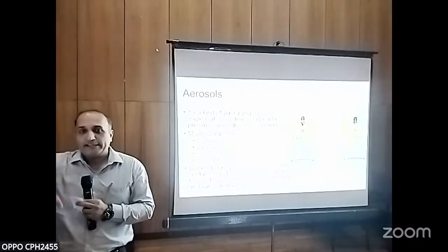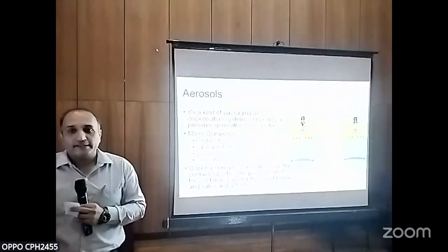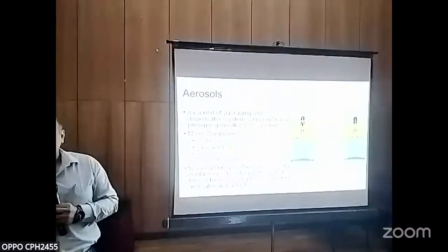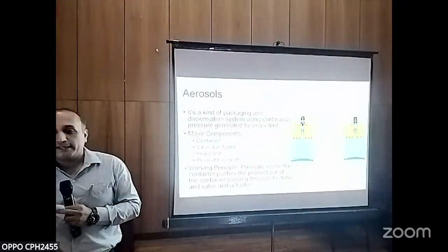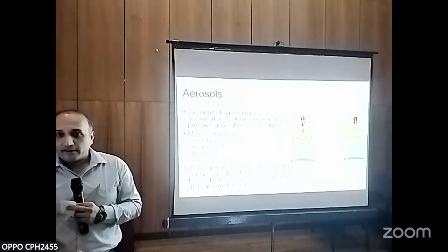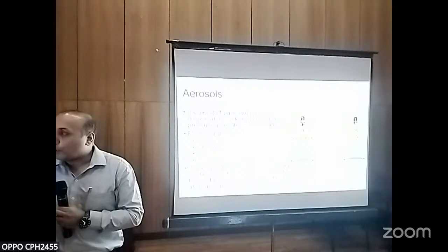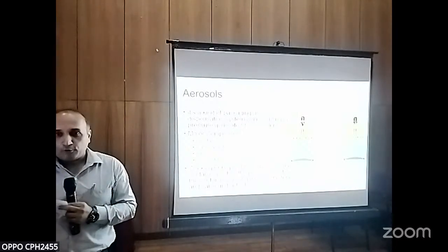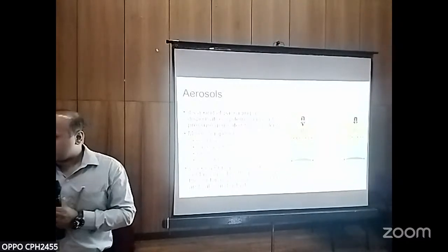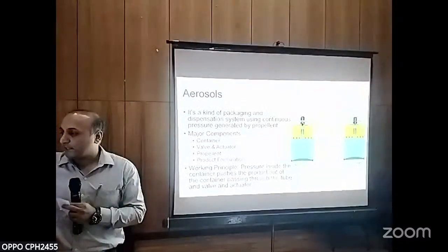Whenever we are trying to analyze a particular cosmetic, the propellant part is never taken into the analysis. What normally happens is the manufacturer declares the net content as 100 grams. The 100 grams normally refers to the contents inside, not the propellant. If they have to give both, then they will give you both. So the quantity of the bulk and the propellant also has to be checked.